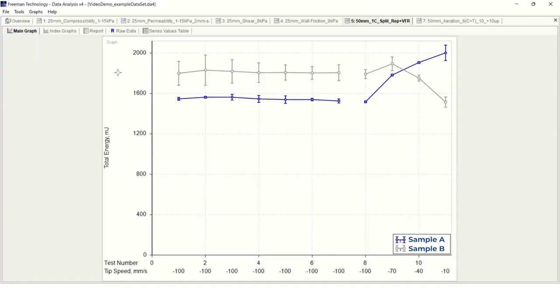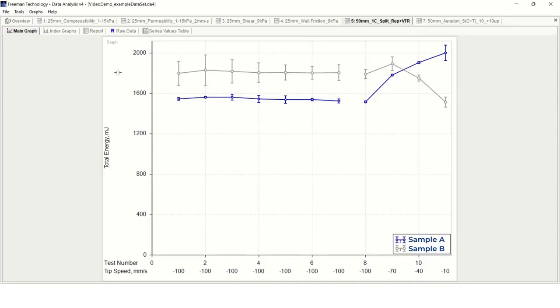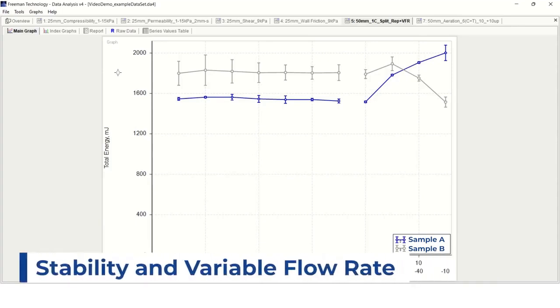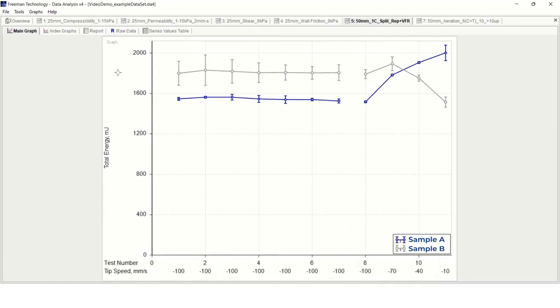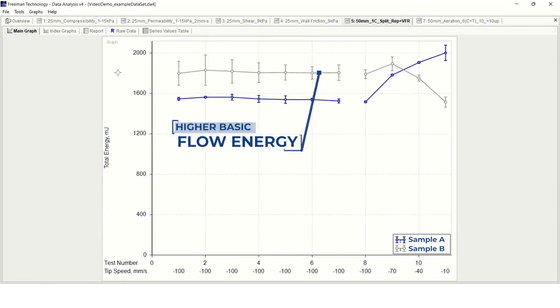Here is a dataset that explains the various tests that can be performed with the FT4. The first plot I am showing here is for the stability and variable flow rate test which we just saw in action a moment ago. This graph compares the two different batches' basic flowability energies across repeated test cycles and at various tip speeds. Here we can see that sample B generated a higher BFE indicating that it has increased resistance to dynamic flow.